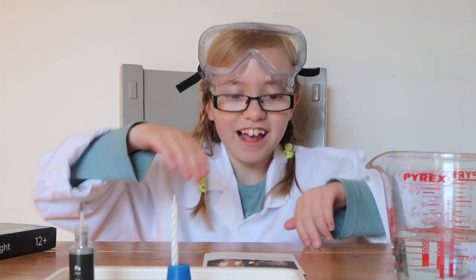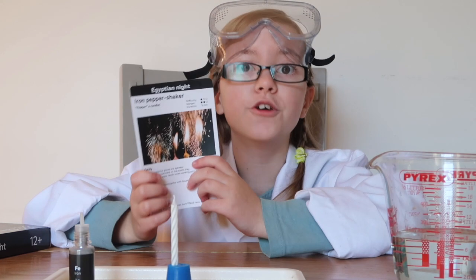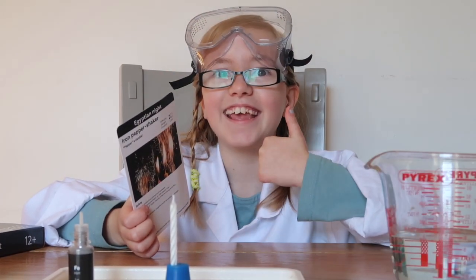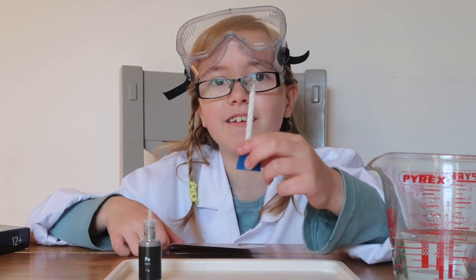The next experiment is — drum roll please — the iron pepper shaker. It does use fire, so make sure to have an adult at hand. I have my mum. Yay! And that means we're making a mini bengal light.